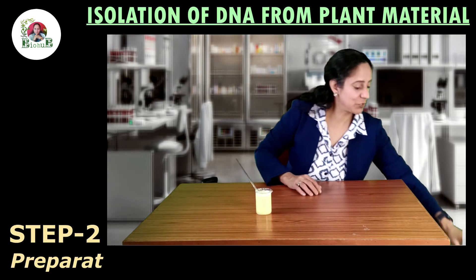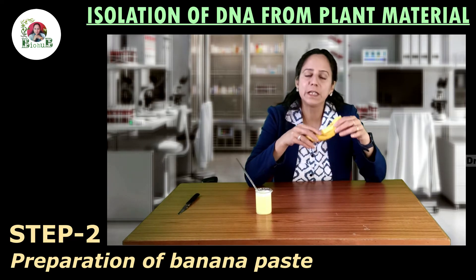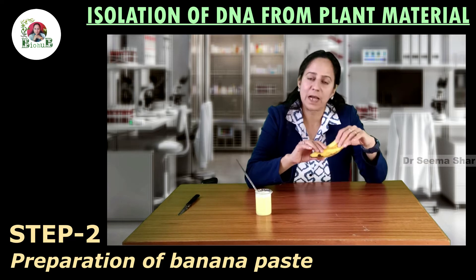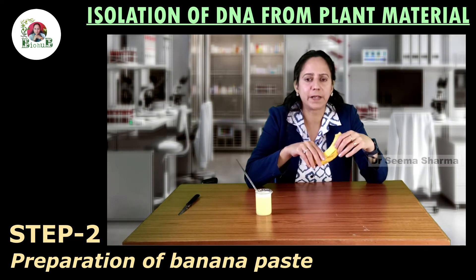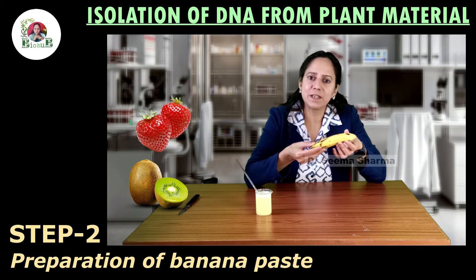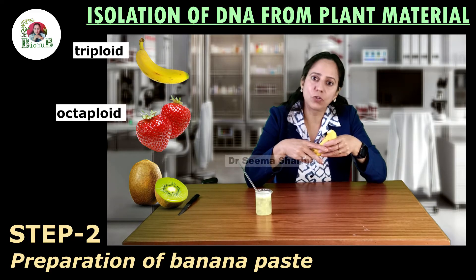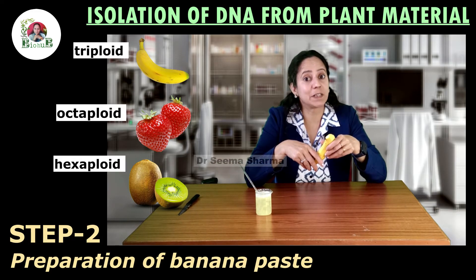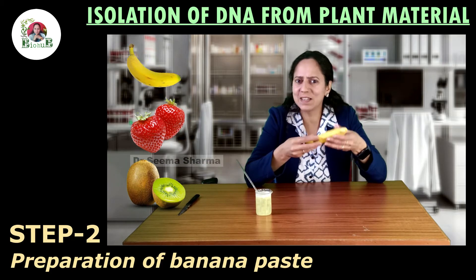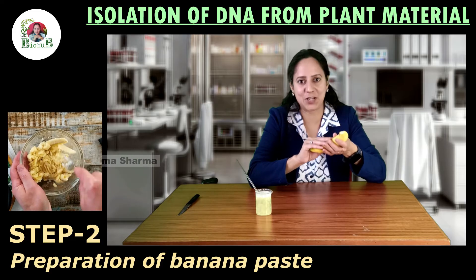The next step is to take the ripe banana. In this experiment, we are isolating DNA from ripe banana fruit. Isolation of DNA can also be carried out from strawberries and kiwis. The reason is banana, strawberry, and kiwi are triploid, octoploid, and hexaploid respectively, so the amount of DNA extracted will be more. Also, these are ripe fruits, so they can be easily mashed up.